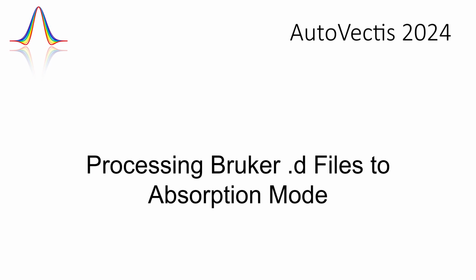In this video, I'll show you how to open Bruker .d files and process them into absorption mode using AutoVectis. I'll be processing Bruker files in the FID format, rather than those in the SER format.